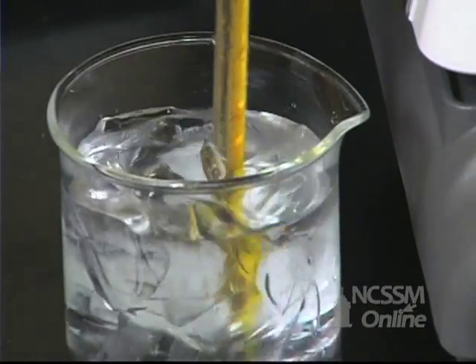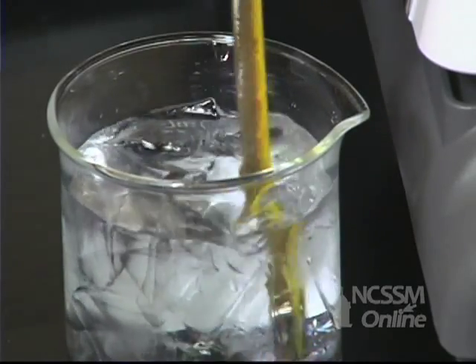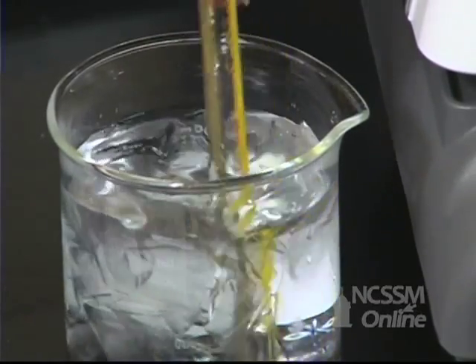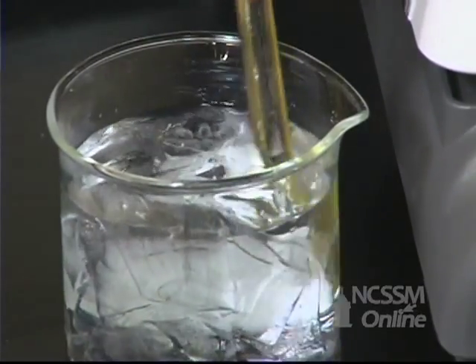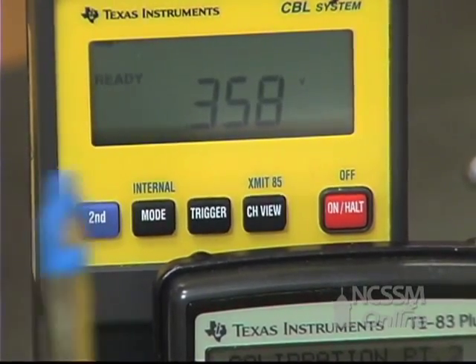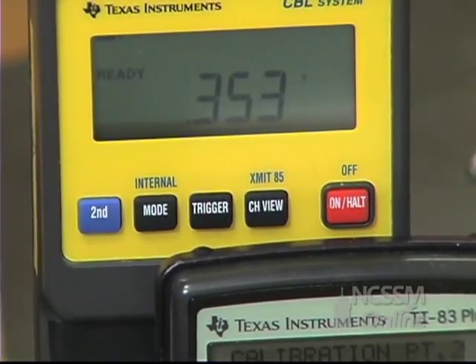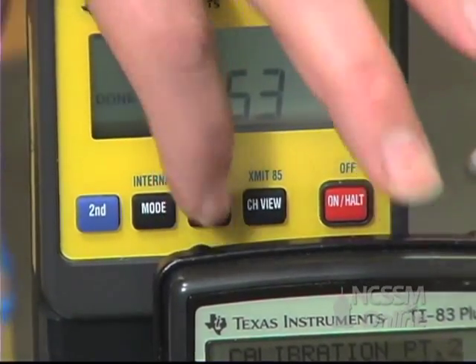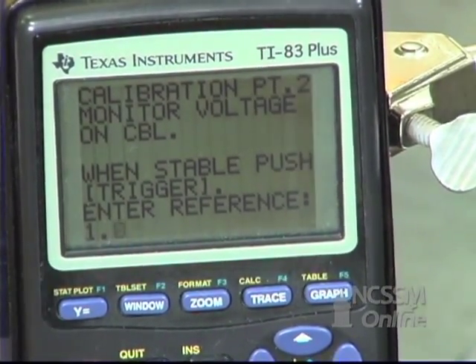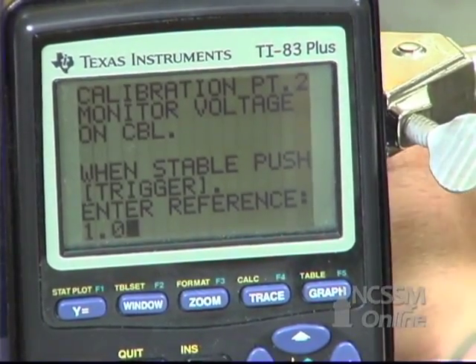We're now going to put the temperature probe and thermometer into an ice bath mixture. Again, we're going to wait until the reading on the CBL becomes stable. We're going to press trigger on the CBL and enter the temperature from the thermometer on the calculator.